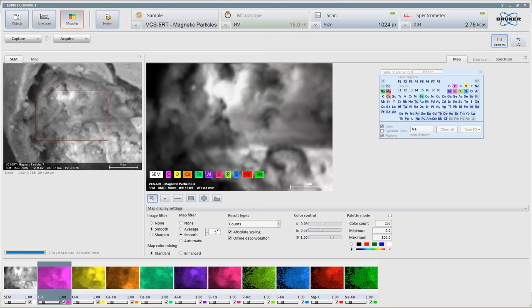That is definitely got some sort of fairly regular kind of form to it. It's lots of little chunks of micron sized particles. But they could stick together. There's a range of different ways, all kinds of different ways.